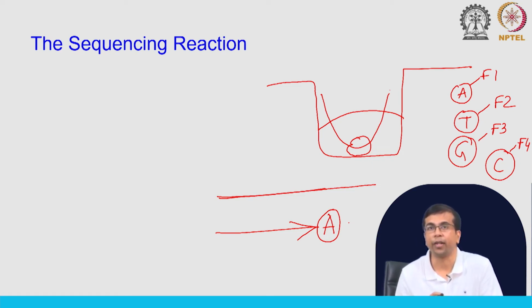Now, one of the questions you might ask: these fluorophores are also present in the well, so why do they not give any signal? These bases are floating around before they are added to the growing strand. Why do they not give signal? Now, when these bases are free, free dNTPs are moving in and out here, randomly and very fast.